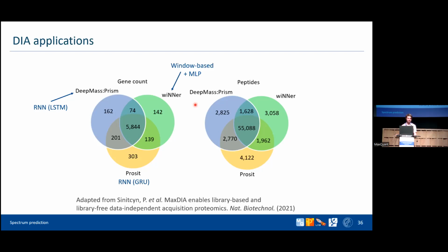So, for example, it adjusts to non-standard proteases, non-tryptic peptides, non-standard fragmentation energies, and so on.